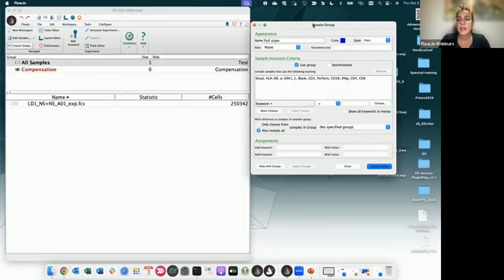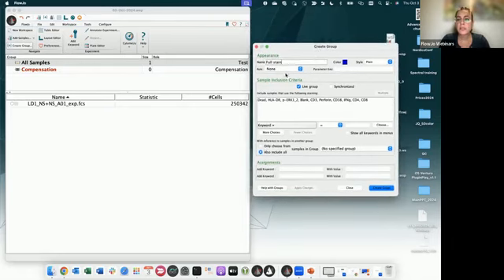Okay. And whenever you create a group, you can assign a color, a style, a role. This can be my test role. And you will see that you have the option to make this group live or synchronized. So what is the difference between live and synchronized group? The live group will automatically include all the samples in the group that have specific features, for example, that are defined here in the keyword tab right here.